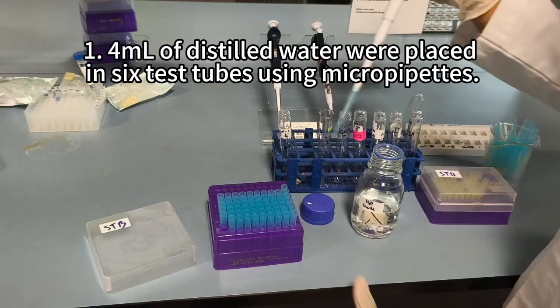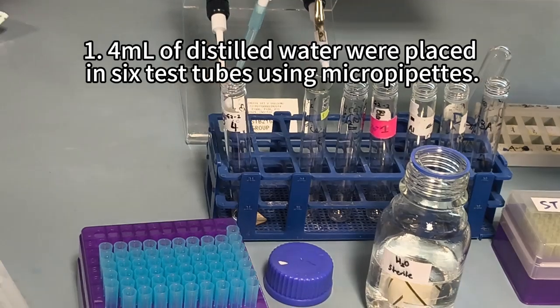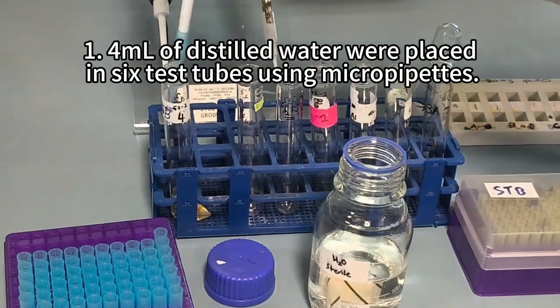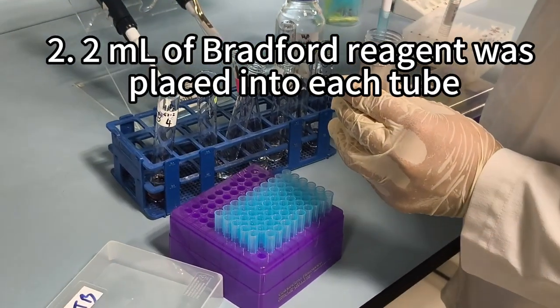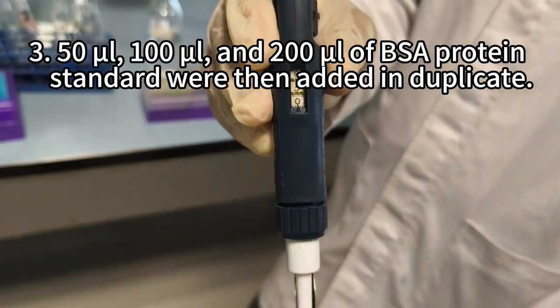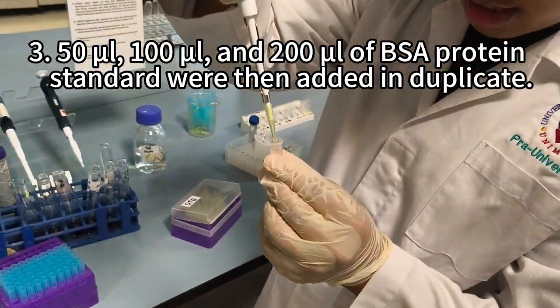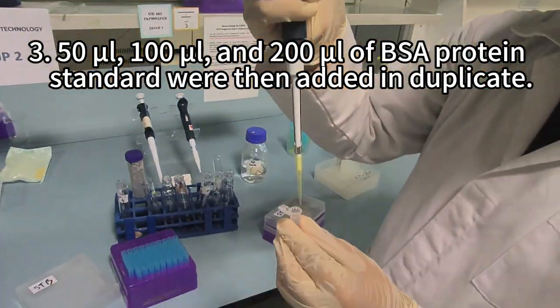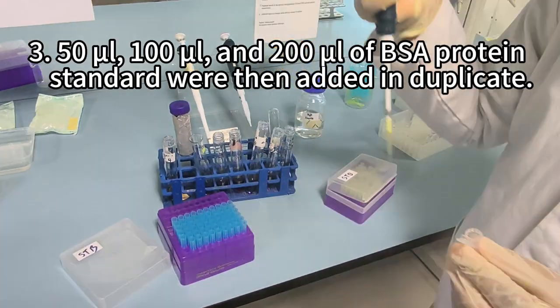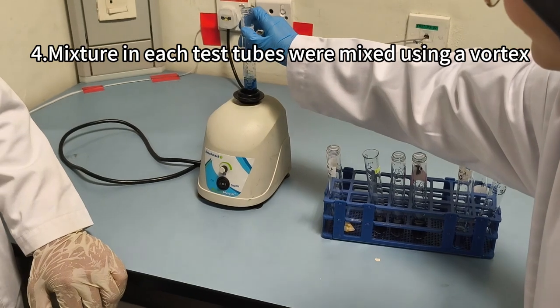Firstly, 4 ml of distilled water were placed in 6 test tubes using micropipettes. Secondly, 2 ml of Bradford reagent were placed into each tube. Thirdly, 50 microliter, 100 microliter and 200 microliter of BSA protein standard were then added in duplicate. Fourthly, the mixture in each test tube was mixed using a vortex.